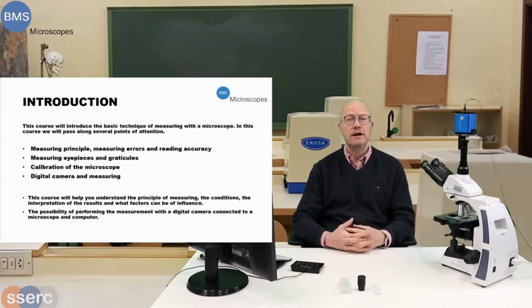And after that, we're going to show you how to use the digital camera and do the measuring also, but then by means of a software program. In this case, it's called BMS Pix3.